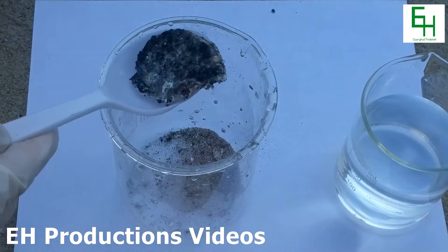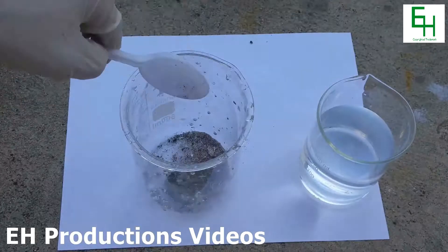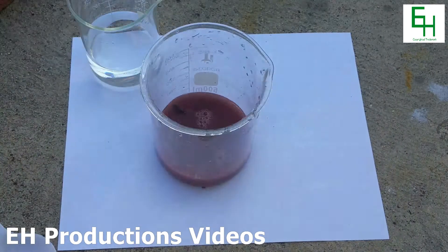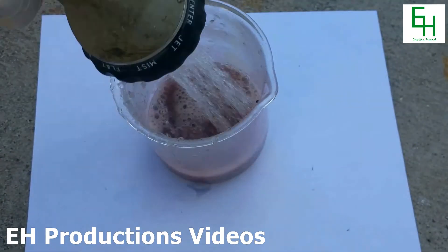Oh, look at this — we got some rainbow-colored ash here. Right now I'm crushing up the slag and I'm pouring in vinegar to react with any of the byproducts. You can see that the solution is still red due to the iron thermite contamination. I'm gonna decant it, and I'm gonna crush it and wash it many, many times.